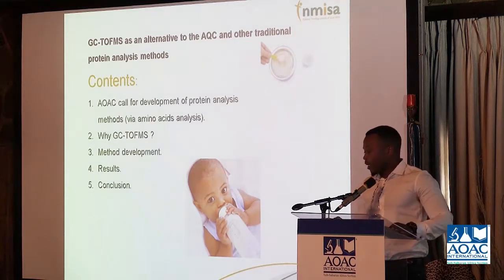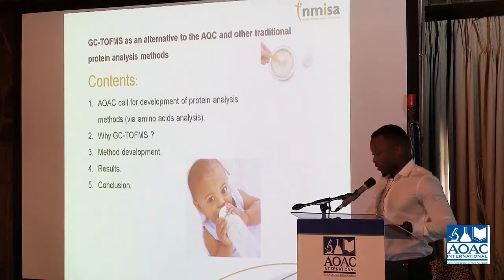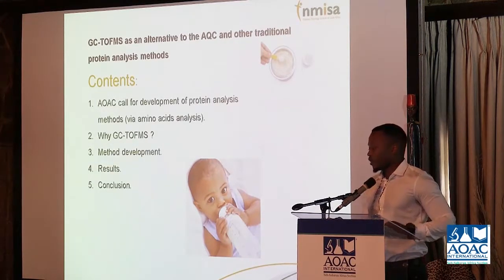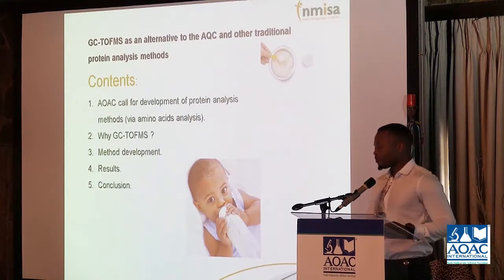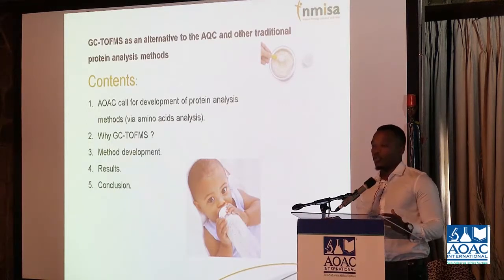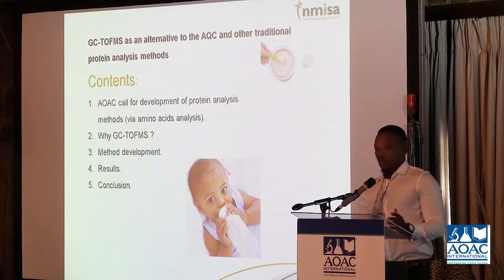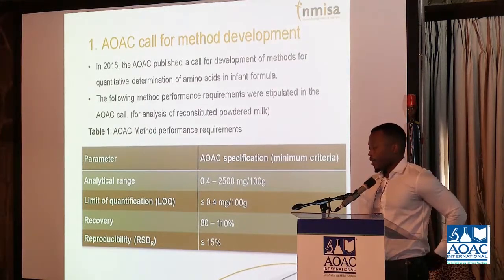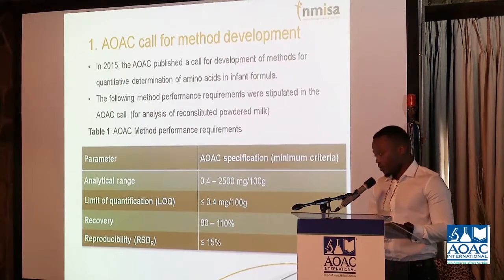So in my talk, I'll try to cover the following aspects, because there was a call by the AOAC in 2015 for the development of methods for quantification of amino acids in infant food. I will explain why, as I have said already, it is important that we develop alternative methods, and that's why we are using the GC-TOF. I will cover briefly the method development and the results. Then I will conclude.